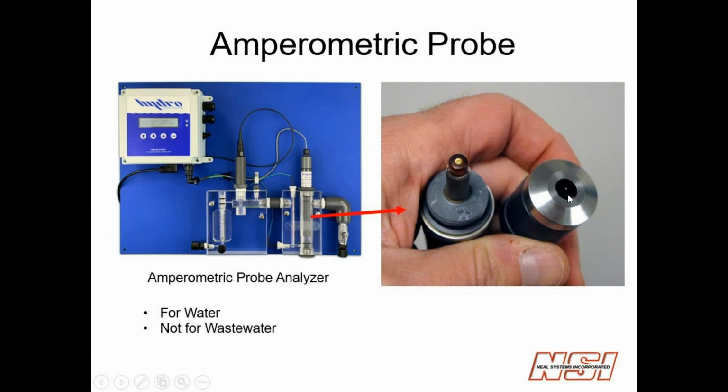The membrane has to be replaced. I would suggest once a year. I've seen them go much longer depending on the quality of your water. It does not tolerate solids very well because the membrane can become fouled.